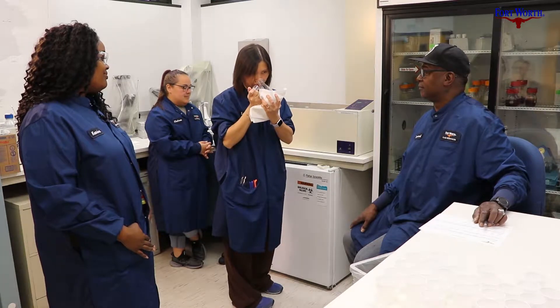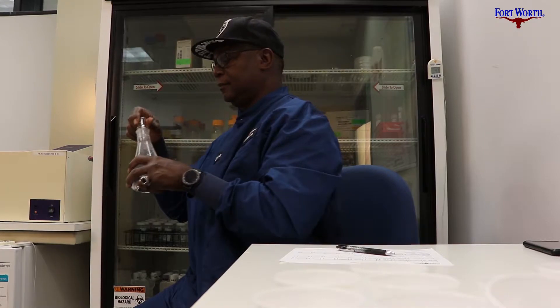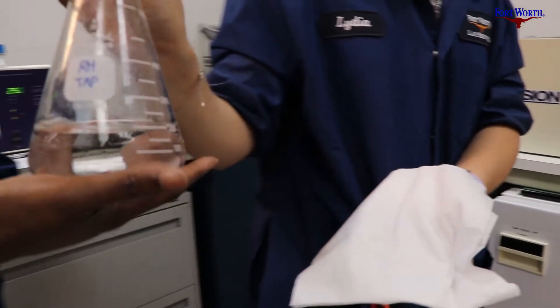We smell both raw and tap water. The raw water being the water from the plants that's still dirty, and then the tap water being representative of your faucet at home.